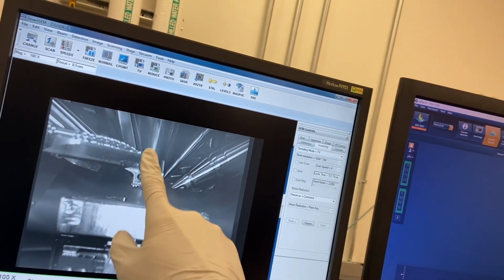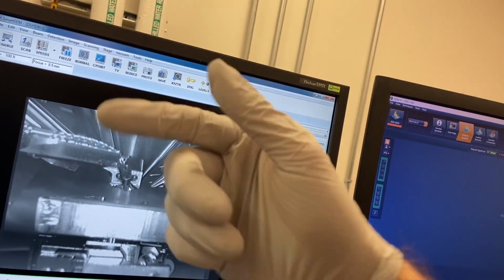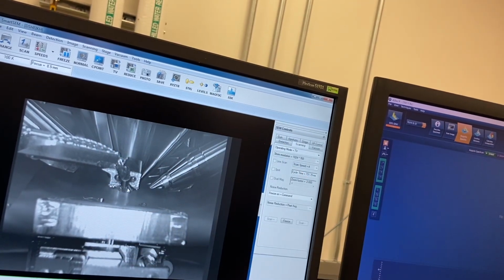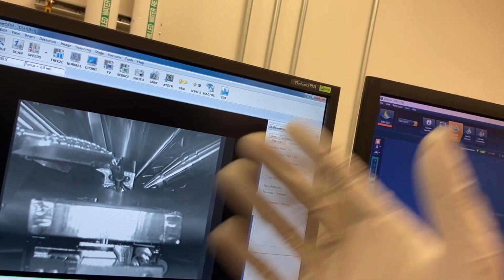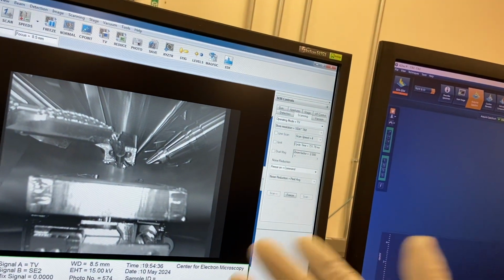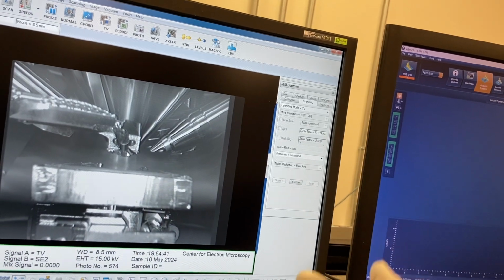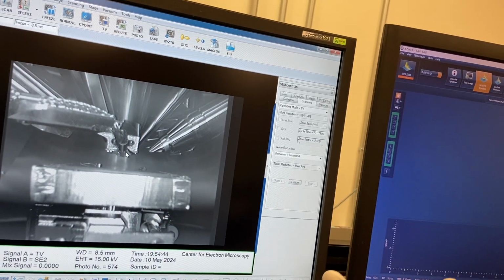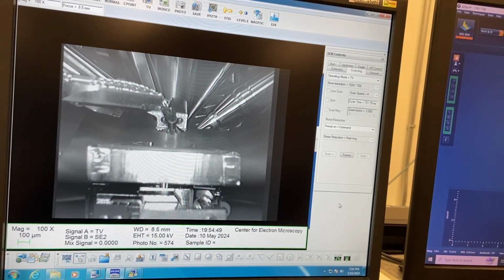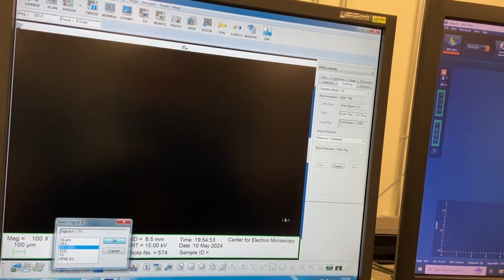Therefore, you're going to get more signal at a given point, and the signal that's measured is by grayscale. So the more signal you get, the higher the number, and that's assigned to something that's very bright versus something that has no signal, it's dark. So anything that's bright has higher atomic Z, therefore it's heavier, and if you want to view it on a density scale, it's more dense. And anything that is darker in color has a lower average Z, and therefore it's less dense, or at least the material on average is less dense, if you want to view it that way. The atoms are less dense. How about that? Okay, so now we're going to go to BSE, and we're going to see how everything works here.